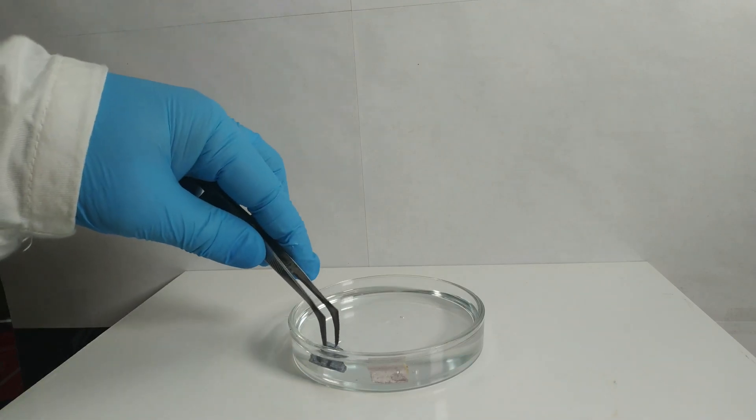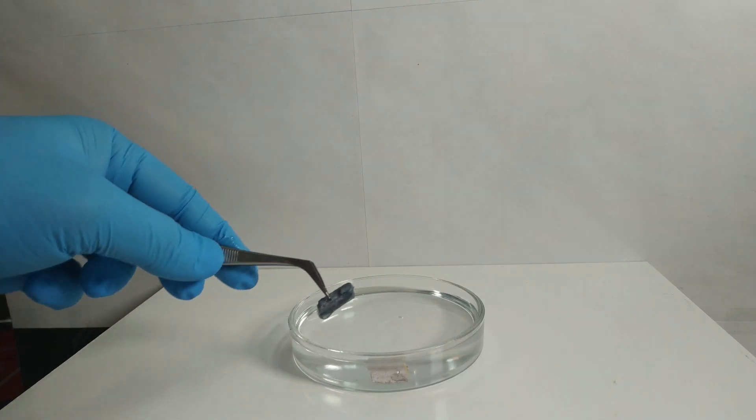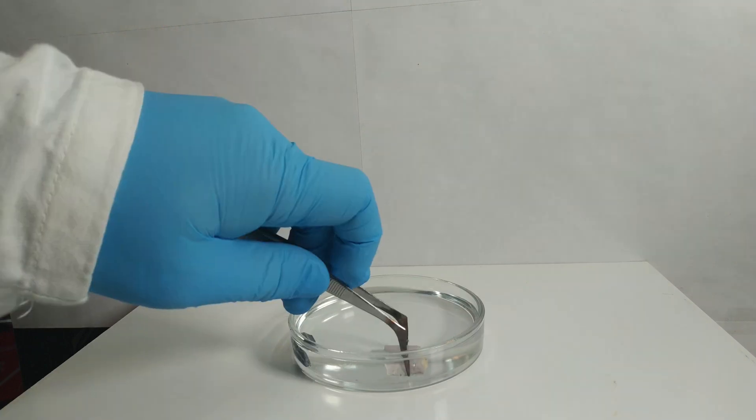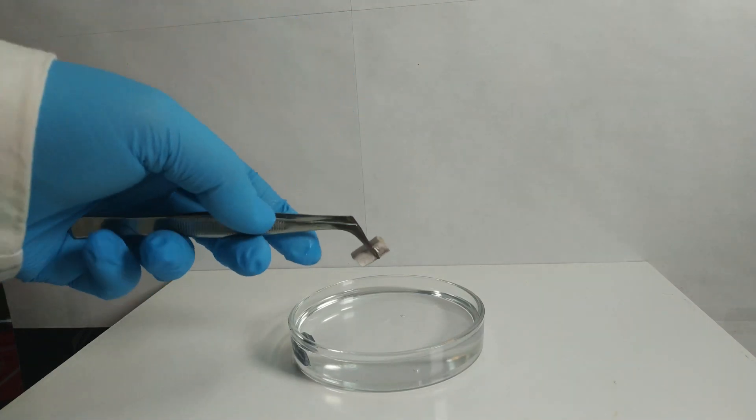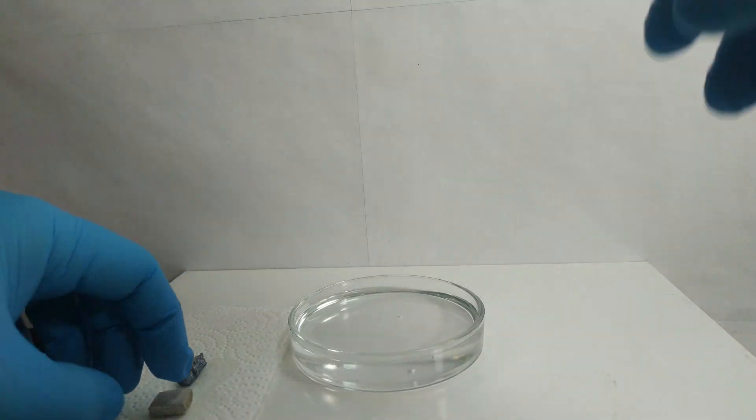Greetings! In this video we want to find out if we can make an alloy by simply pressing two metals together. Stated more precisely, we will use sodium and potassium for this.